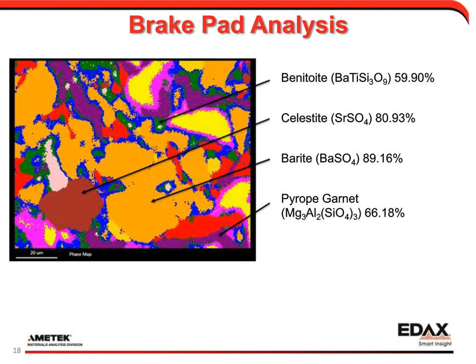So it matches up with 66% confidence in this case, which tells me this phase is probably not straight up pyrope garnet. I will probably have to go in and analyze this a little further, whether it's just because there's contamination as well. If I have carbon on top, that will throw off my match. Or if it's really because my spectrum library is incomplete compared to this sample.